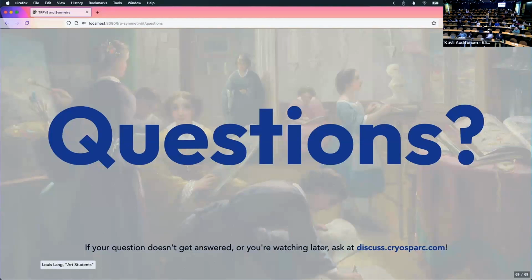Yeah, that's awesome. Going back to the calmodulin example, where you have one calmodulin paired out to these four positions, and you had prior knowledge that there was just one calmodulin. Suppose you didn't have that knowledge, you would have differences in density because it's a quarter of the thing. I was wondering if you want to make that a criterion, but let's take a more difficult case. Say instead of one calmodulin, you have three calmodulins occupied in the tetramer. Now you're going to have a small decrease in density.